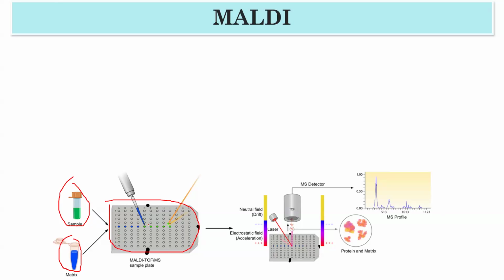You mix them, and you see these spots. They are like small dips, so you can put your sample there. And if you observe, in this you can do many samples at one time. You can name them like A1, A2, A3, and then also B1, B2, C1, C2.